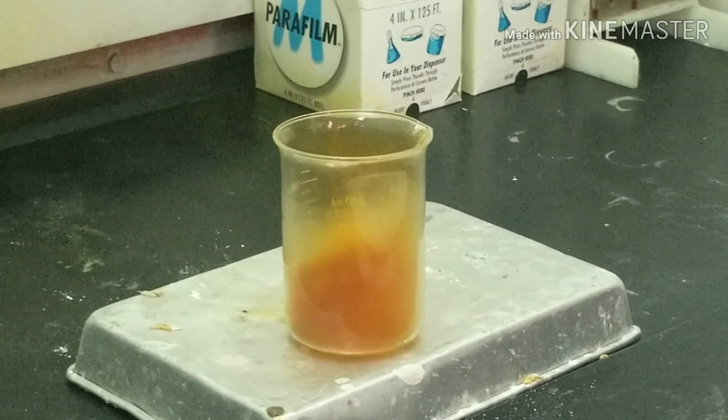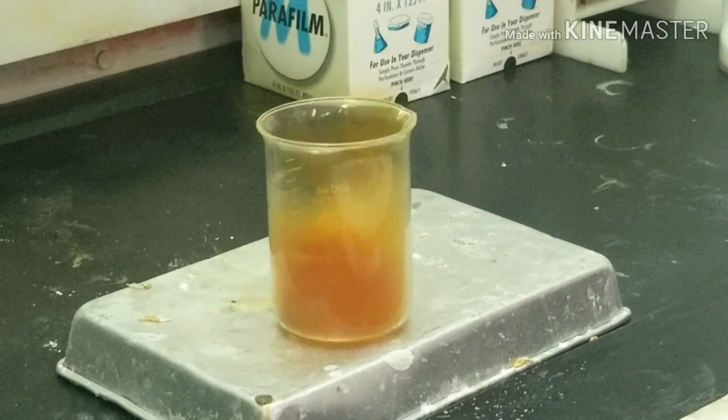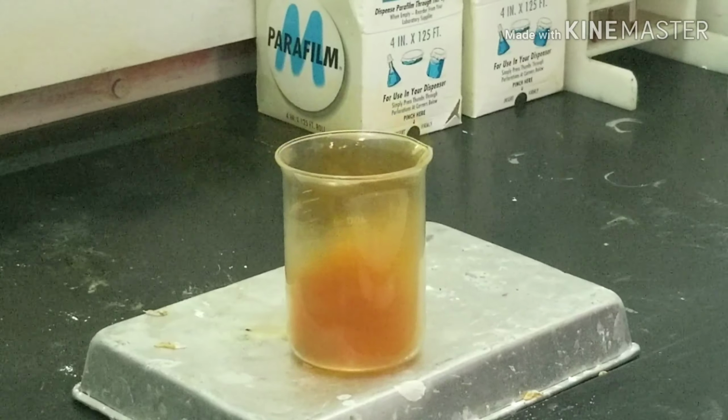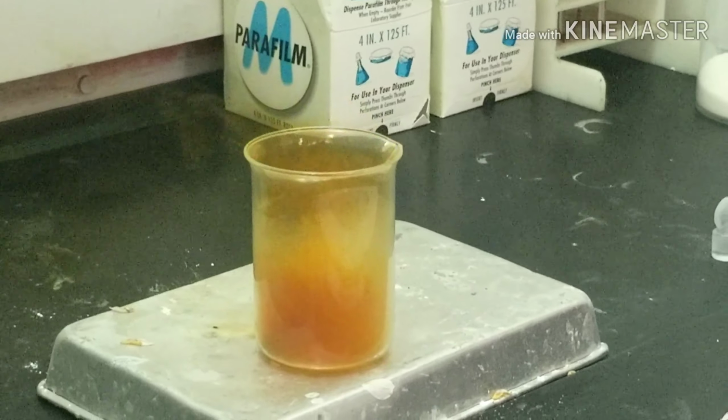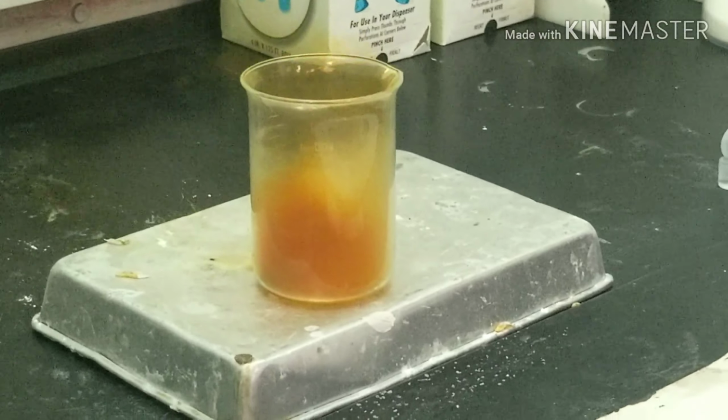After the gas settles down and the gas reaction slows, we're going to see, I think, a blue color. That blue color will be indicative of copper ions. They're going to be present.